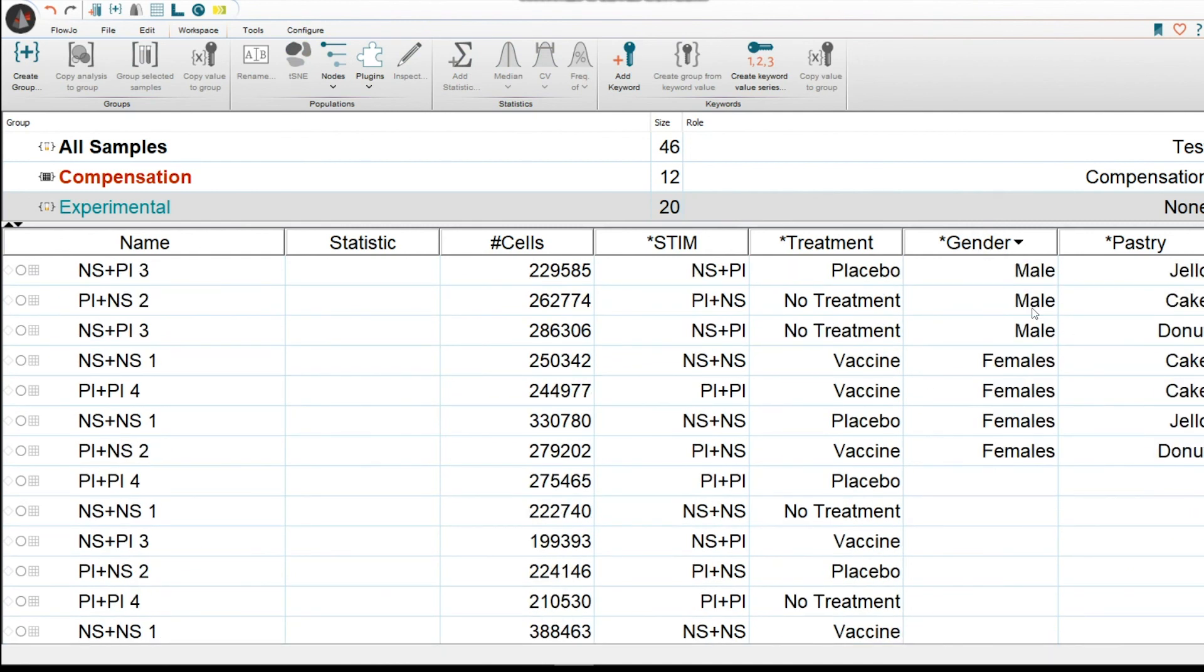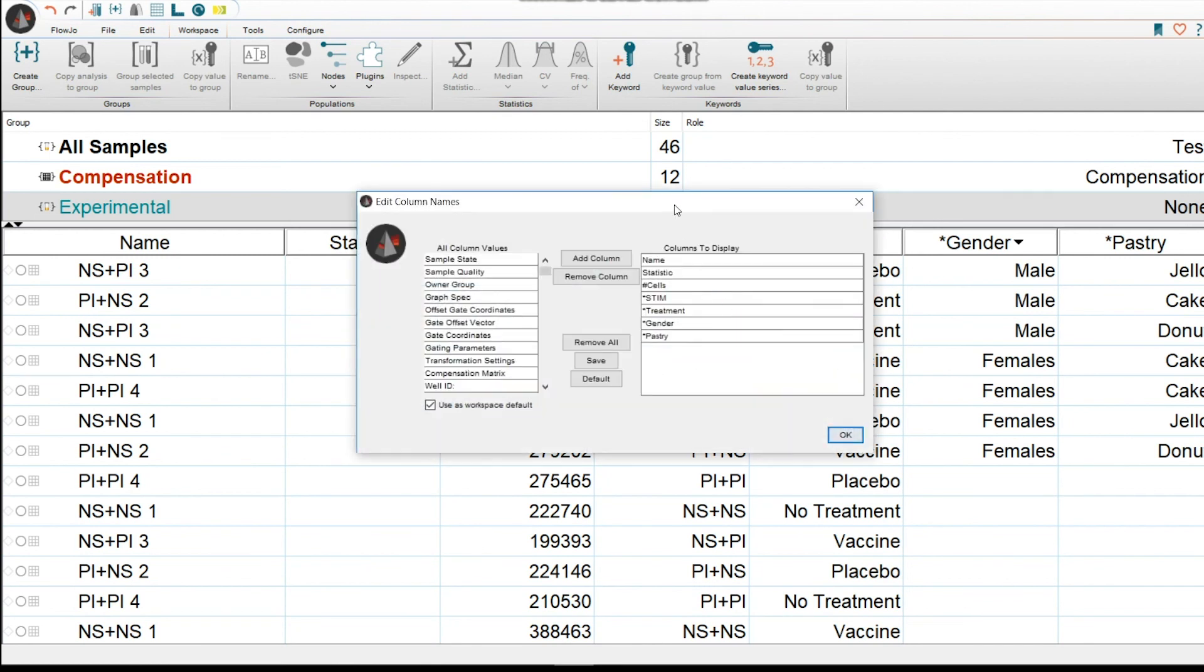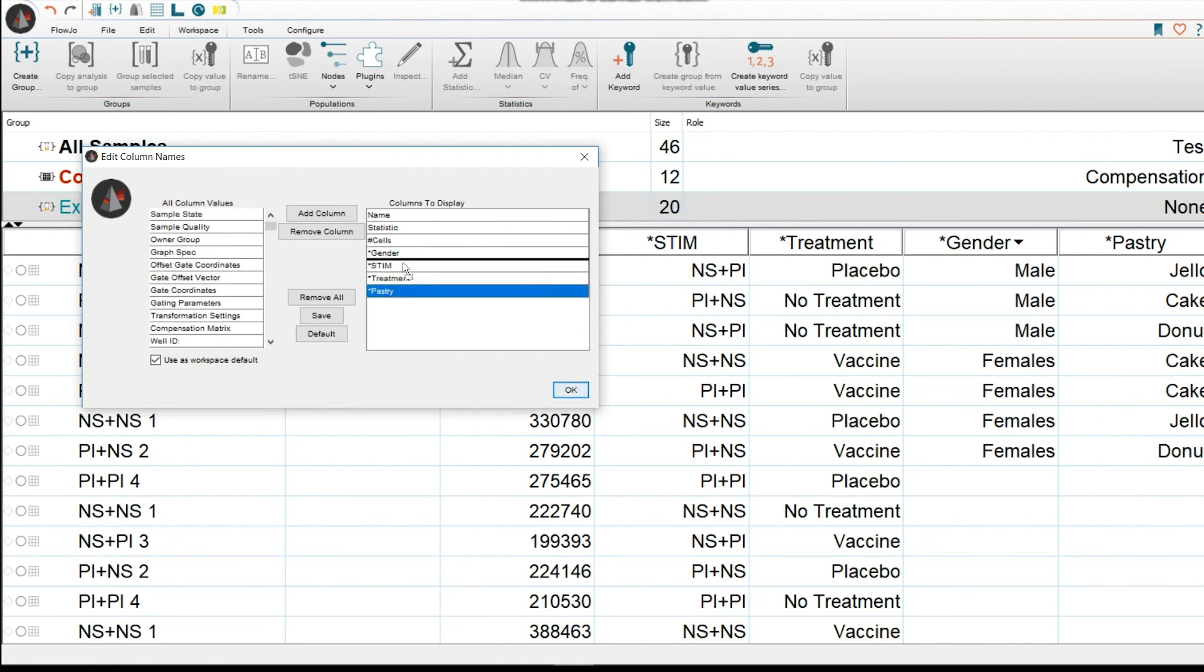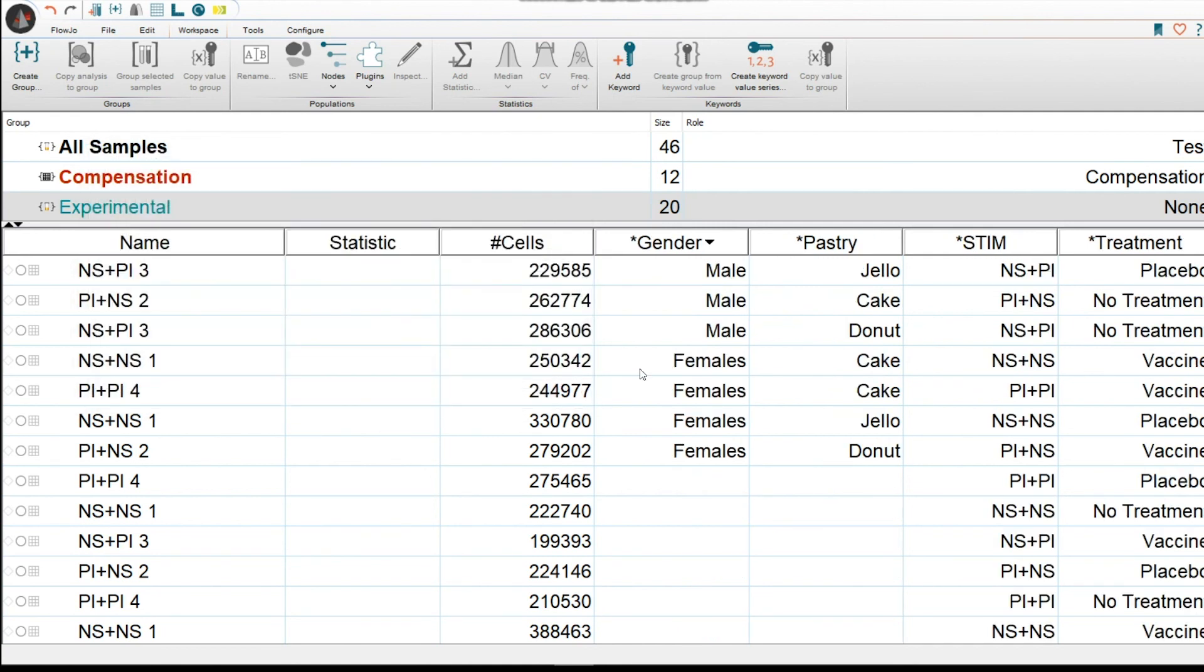The last thing that I also want to go over is we could change the order in which we see the keywords here in the columns. You would do right click, Edit Columns. Here we could then let's say that we want to put gender after cells, pastry after gender, and we're going to leave treatment at the end. OK. So then you press OK. And there you go. You've also changed the order.